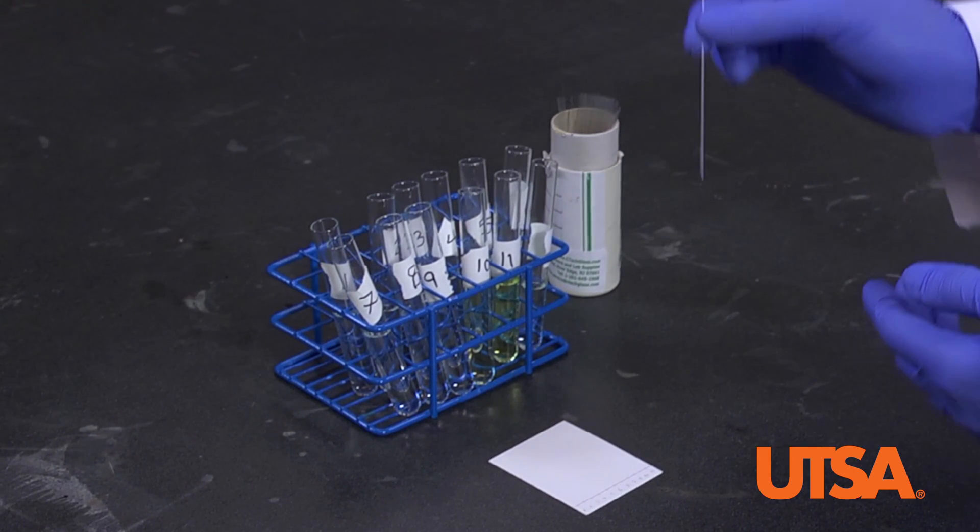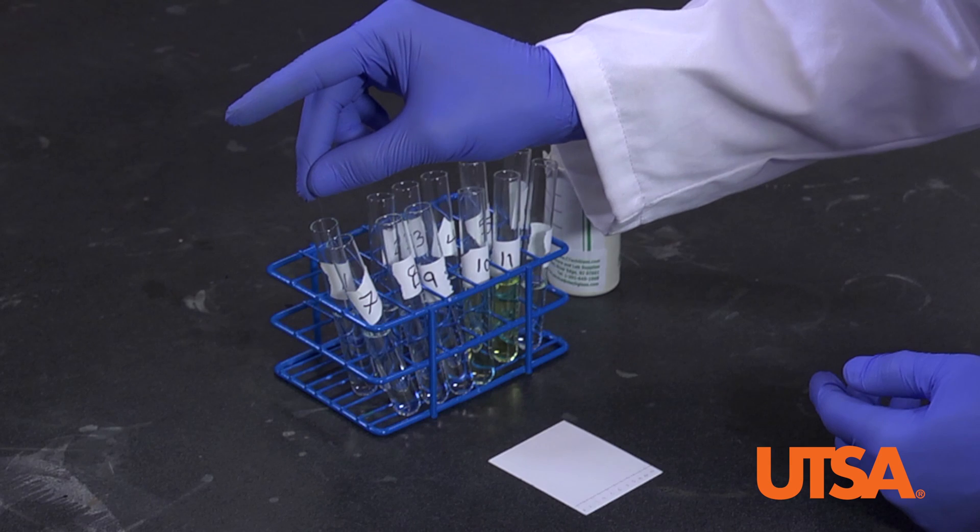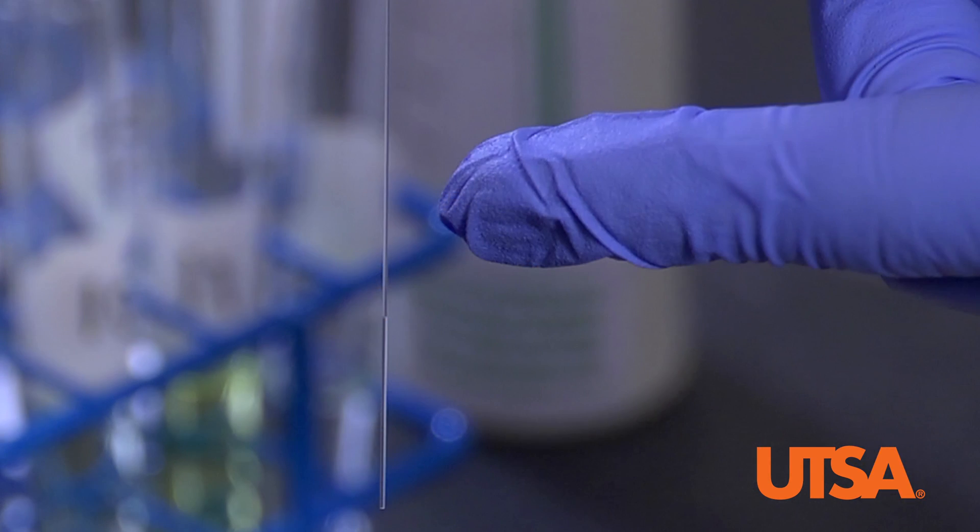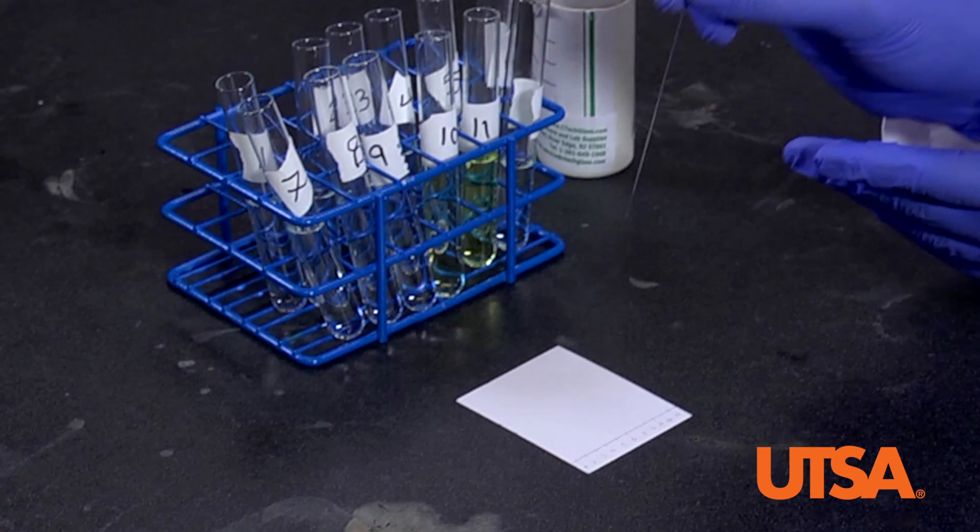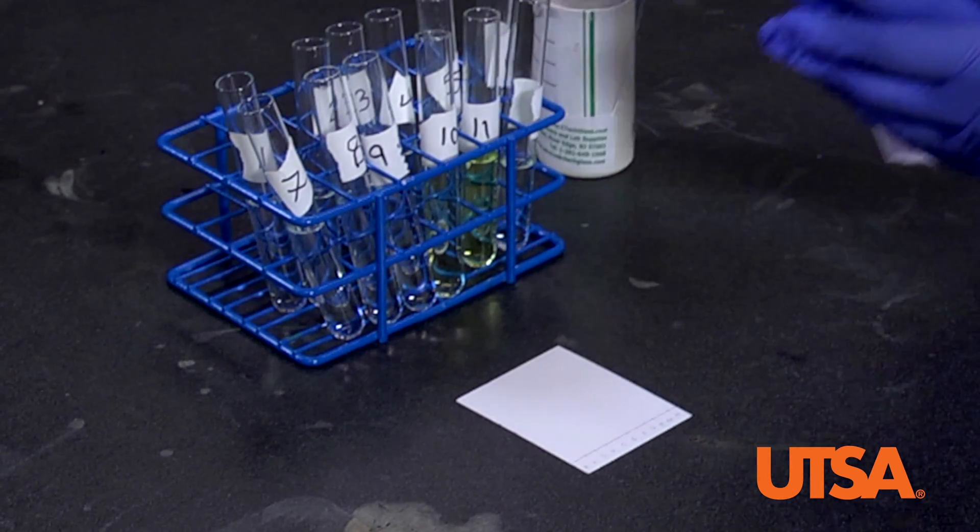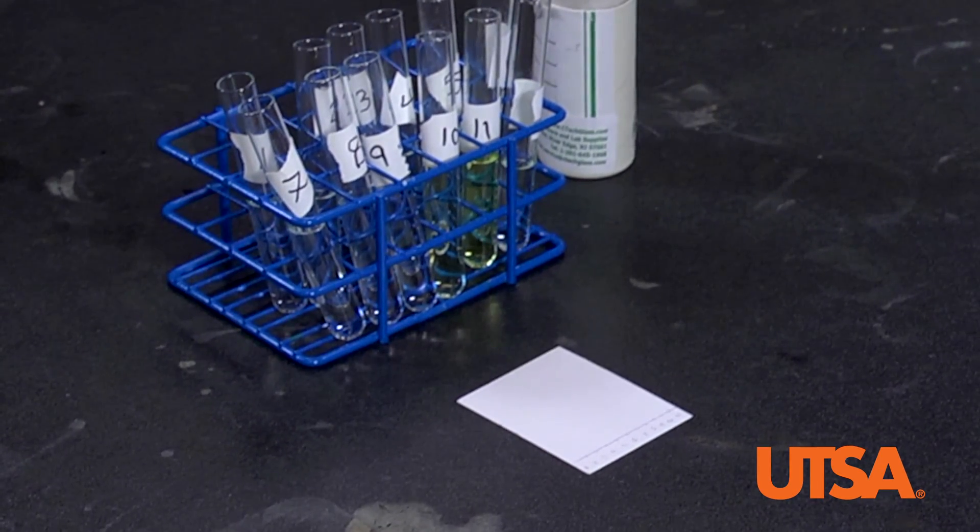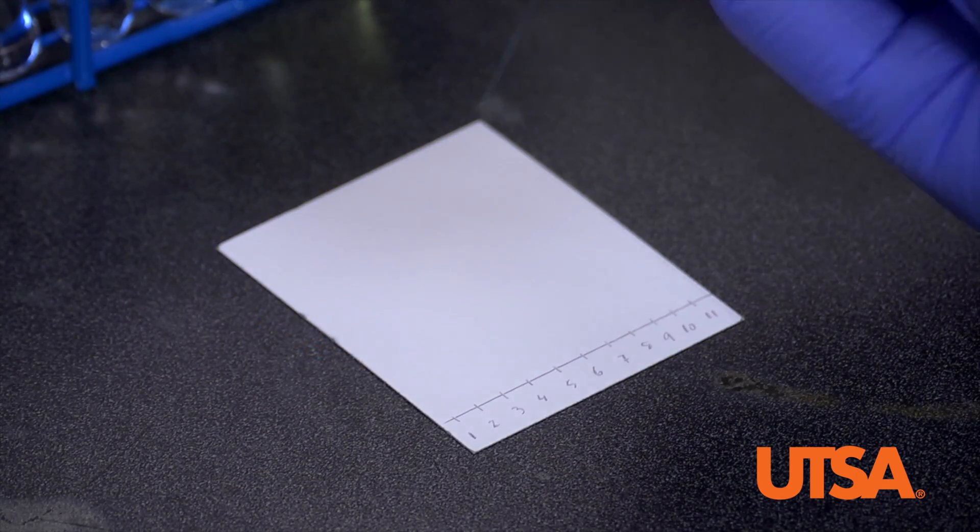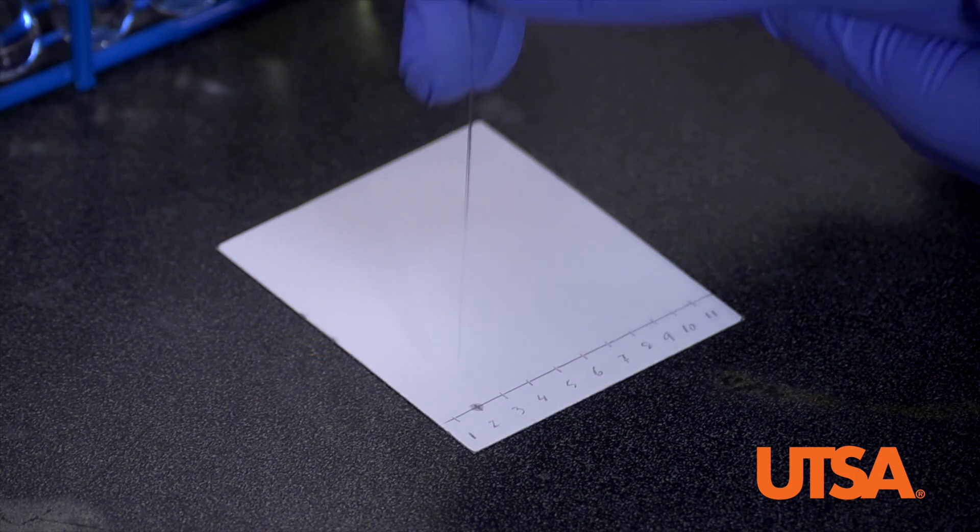Grab a capillary tube and dip it into fraction 1. You will see that the liquid makes its way up the tube. Spot fraction 1 on your TLC plate. Dip it for just a second and switch to a new capillary. Continue by spotting the rest of your fractions onto the TLC.